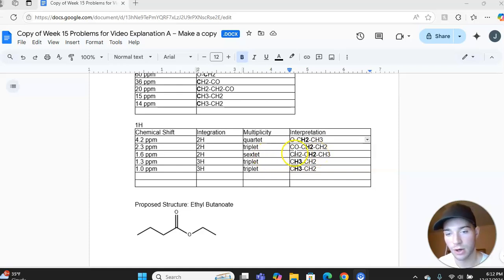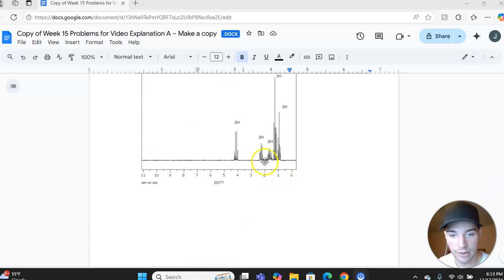This was off the carbonyl group that I drew in, and well, technically the ester, but the carbon was bonded to a CH2, and then the middle one was the sextet, technically the butanoate part of the ethyl butanoate molecule. So it was this carbon right here was the sextet, and then the other peaks here just confirmed this.